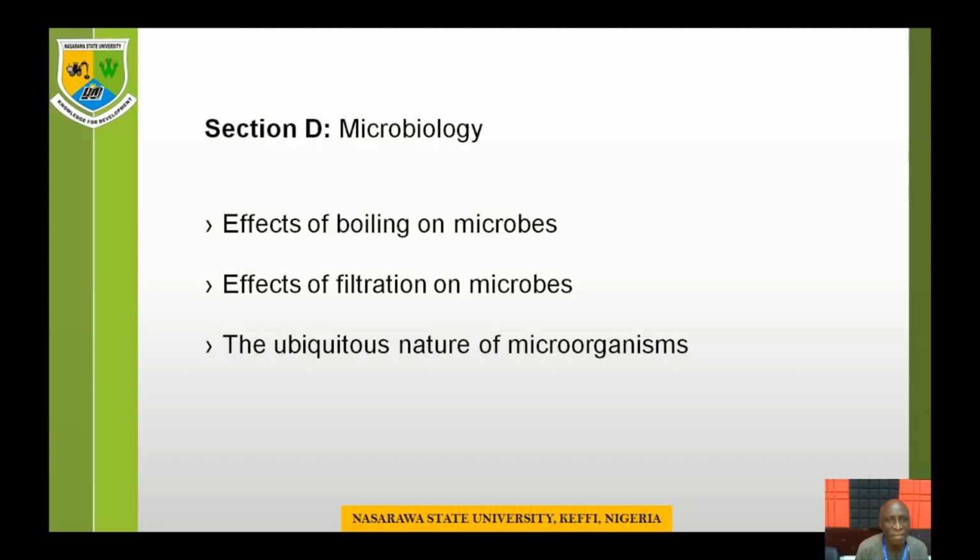In section D, we're going to introduce you to some aspects of microbiology, studies of small, tiny living organisms that cannot be seen with the naked eyes. And in this case, we'll be looking at the effects of boiling on microbes. We'll also be looking at the effects of filtration on microbes. And we'll look at the ubiquitous nature of microbes, how they are found everywhere, in the air, in water, and in the soil. So we'll be taking samples from the soil, from water, and from the air to find out the presence of microorganisms.